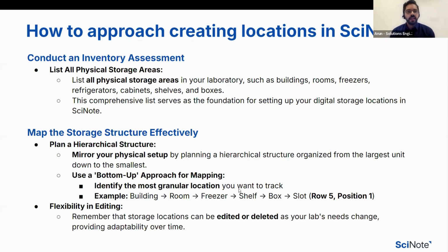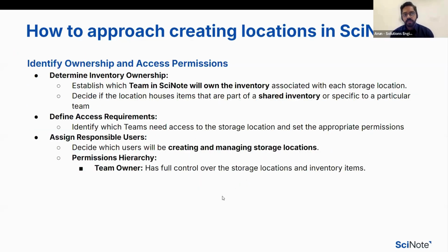Yeah, there we go. So I'm going to spend a few minutes just talking about how you should approach setting up your storage locations in SciNote. And these are just some best practices that you can take into account as you're trialing this feature or using this feature down the road.